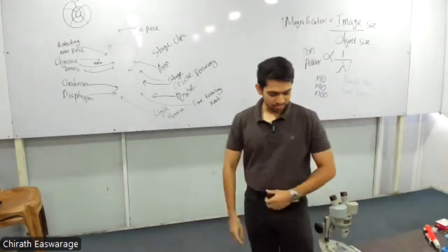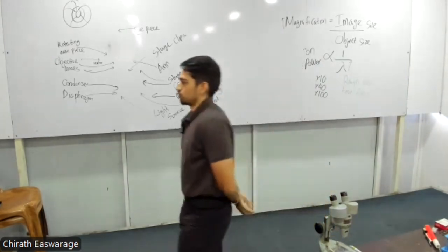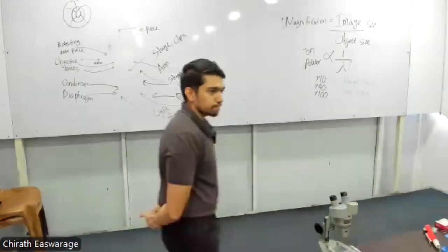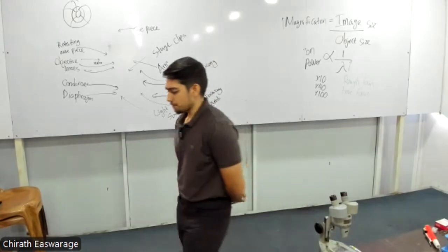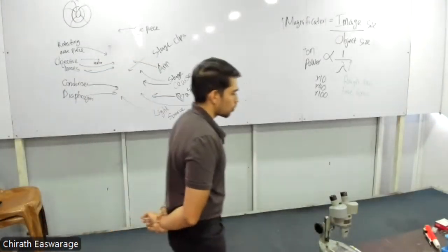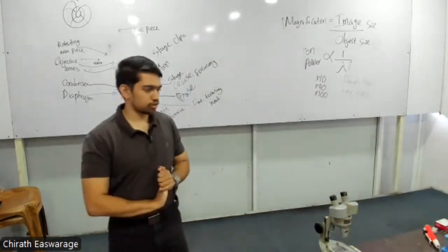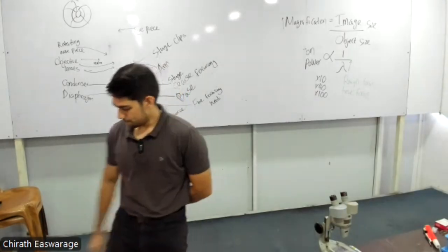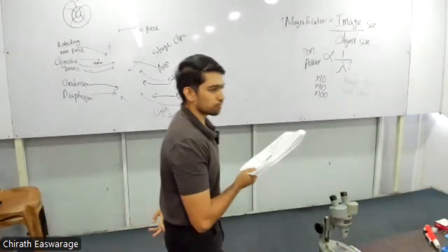So as I was saying, the coarse focus will lock. Then to use the fine focus, what is the purpose of the fine focus? Focus the image, write down, focus the image by making small changes. Those are the parts and the functions you need to know. Online students, any questions? No? Then go home and read the proper handling of the microscope.